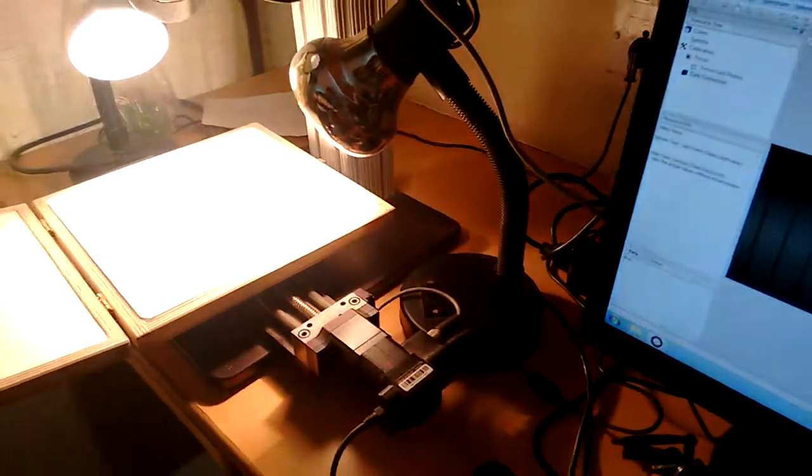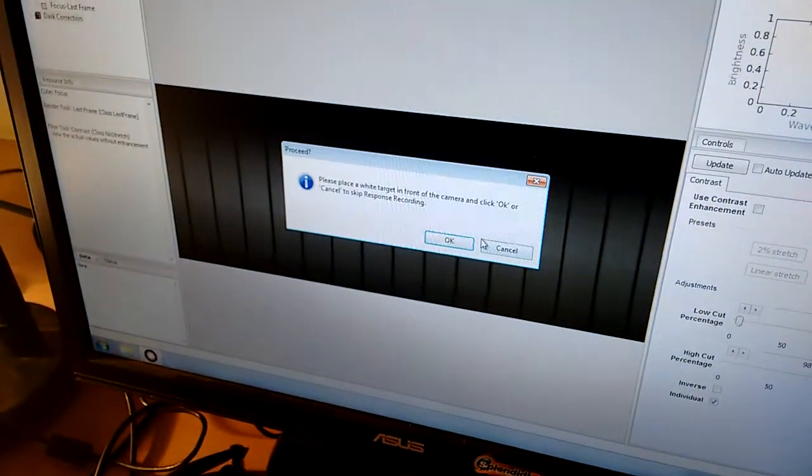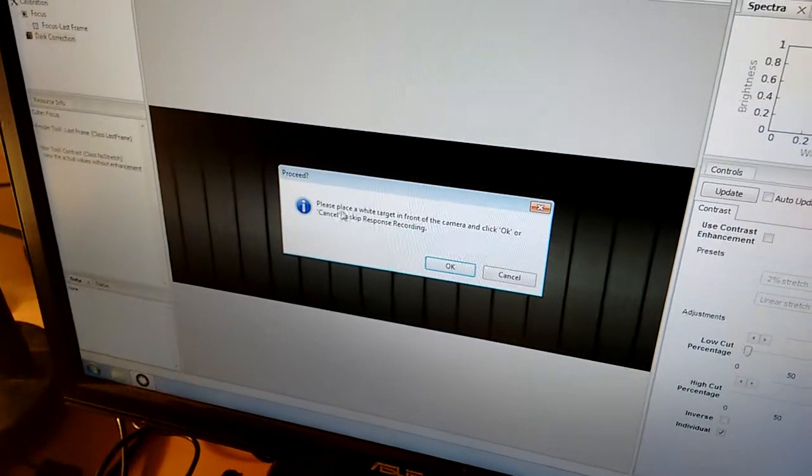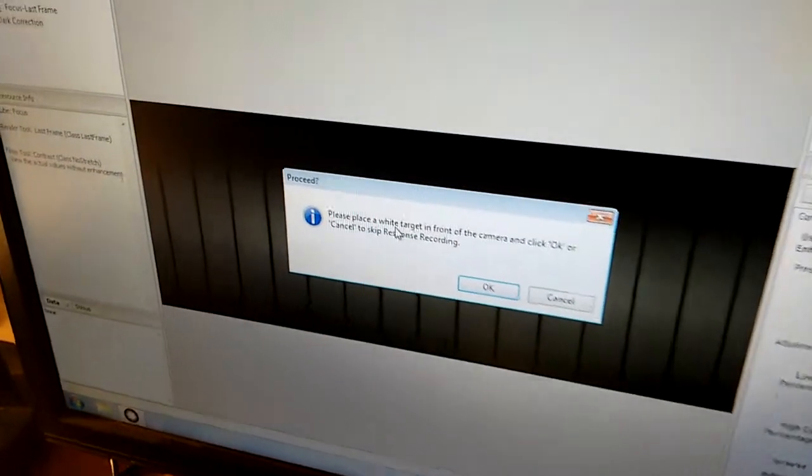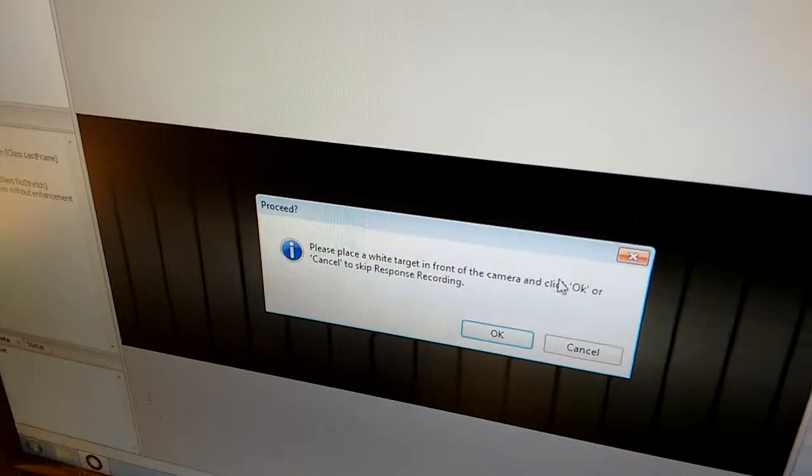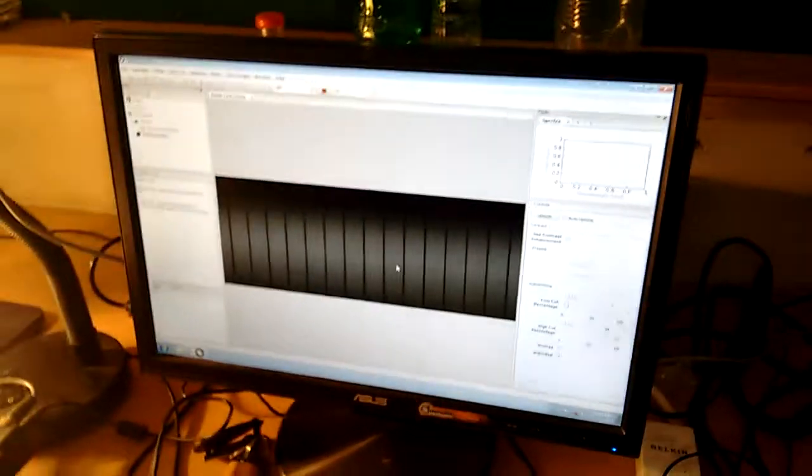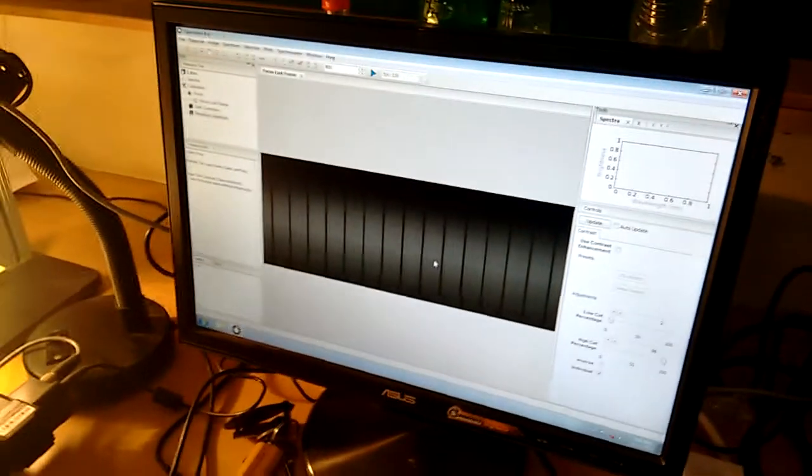And click on reflectance target. It gives a warning again, please place a white target in front of the camera and click OK. I say OK. It took the reference.